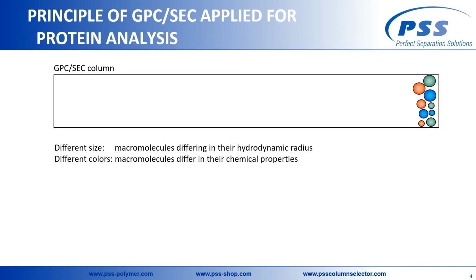One of the most versatile tools to investigate macromolecular structures is GPC-SEC, gel permeation or size exclusion chromatography. It is an entropy-controlled liquid chromatography technique that separates molecules based on their size, or rather their hydrodynamic volume, in solution. With calibration or advanced detection, GPC-SEC allows for the determination of the molar mass distribution.